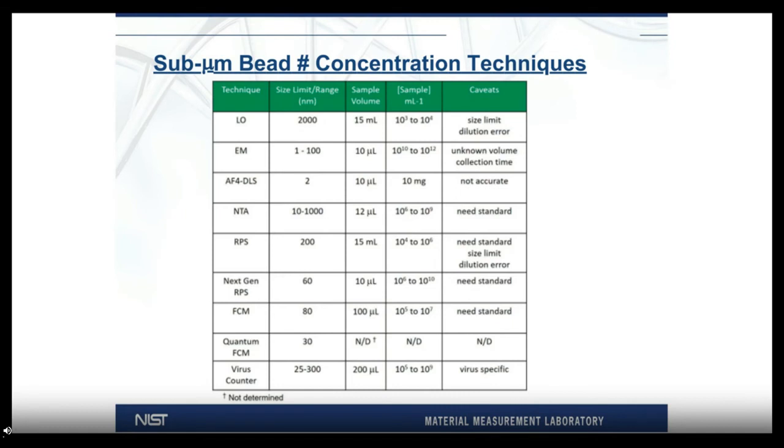And then here's basically a summary of everything I just said about the different techniques, going over each technique, specifying the size limit and size range, the optimum sample volume for the particular technique, the optimum concentration range for the technique, and caveats.